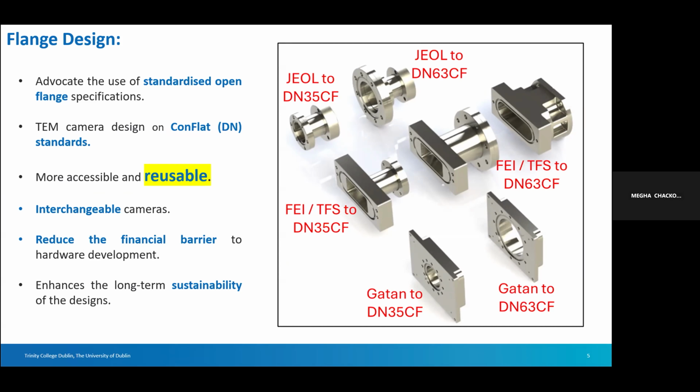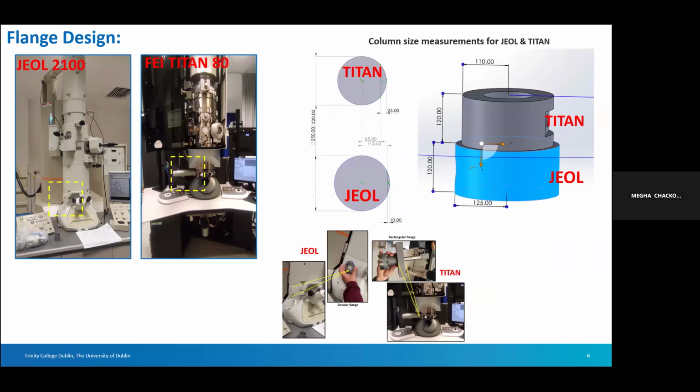these cameras, or the whole detector setup, between different instruments and between different institutions, and you don't have to make a new design. You can just reuse and interchange, which can reduce the financial barrier of hardware developments, and it can enhance sustainability. On the right-hand side, you can see the designs which we have already made for different instruments: JEOL, Titan, which is a Thermo Fisher camera, and for the Gatan cameras. These are based on the CF63 and CF35 flanges.